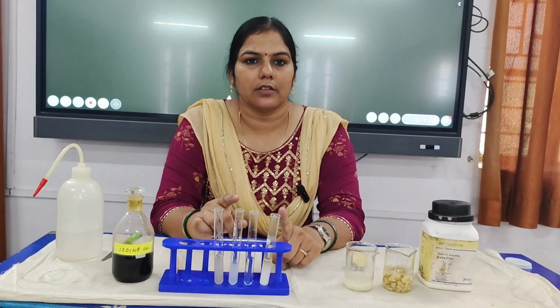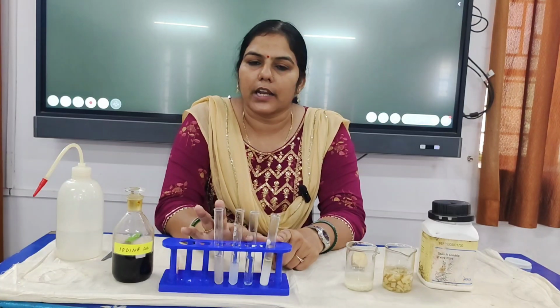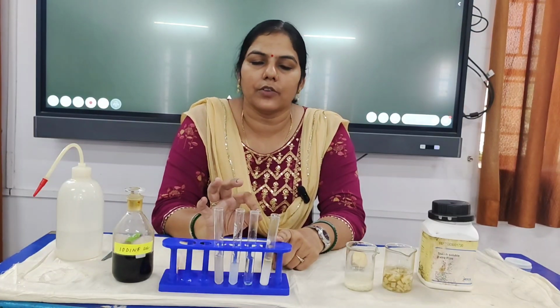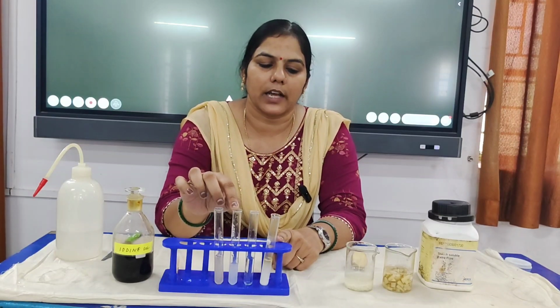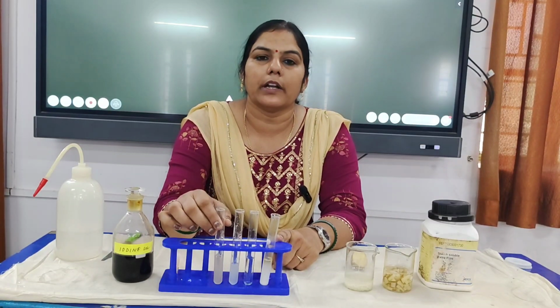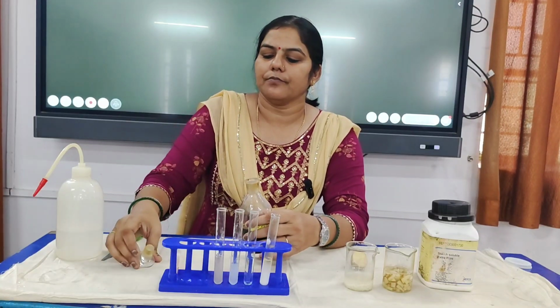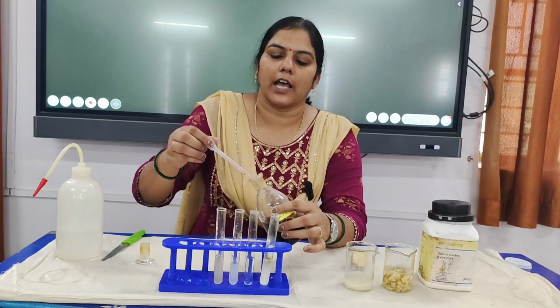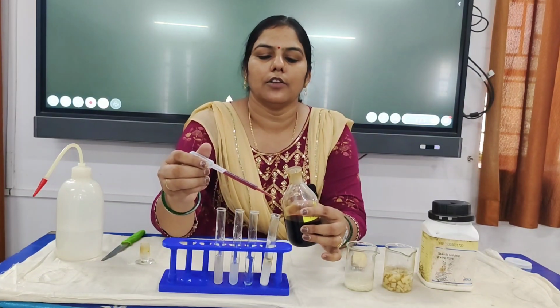The first one is starch solution, which will serve as a positive control. The second tube is plain water, which will serve as a negative control. Then the third tube contains rice water, and the fourth tube contains potato water. Now we have to add 4 to 5 drops of iodine to each of the test tubes and note down the color.